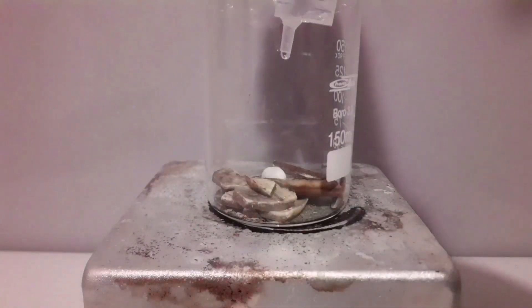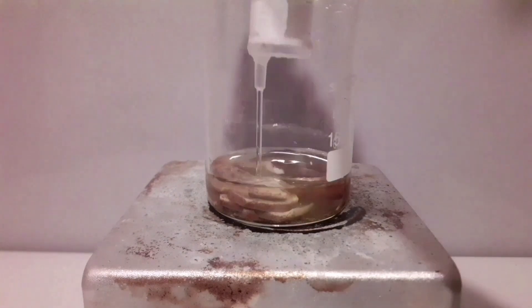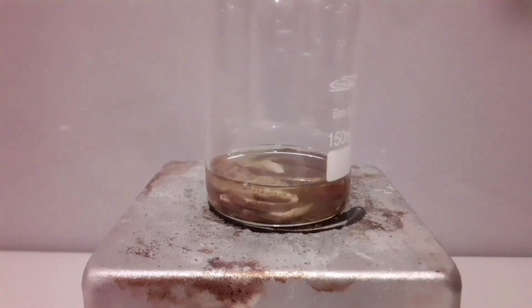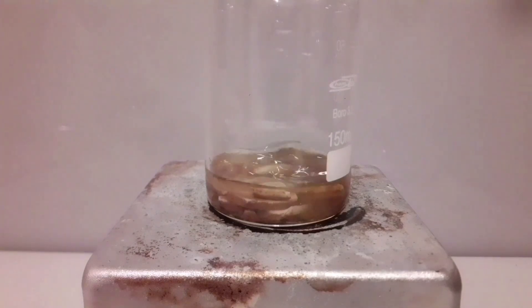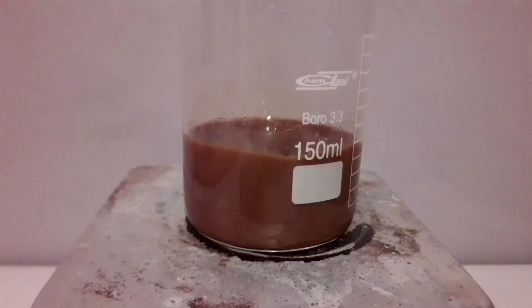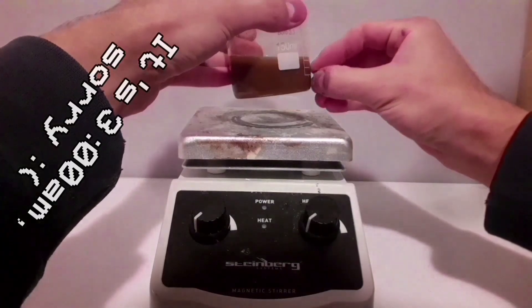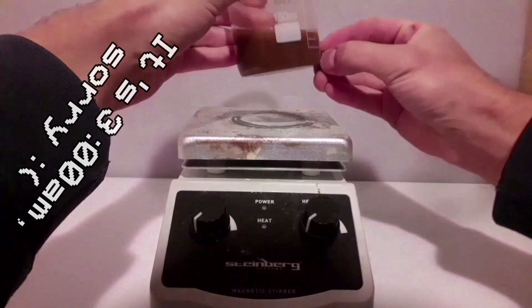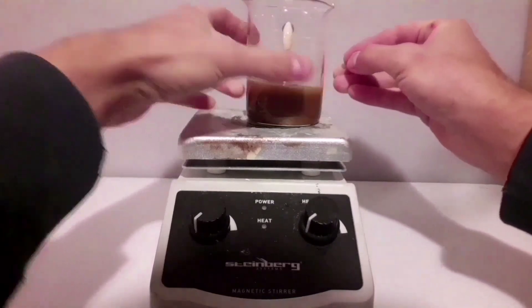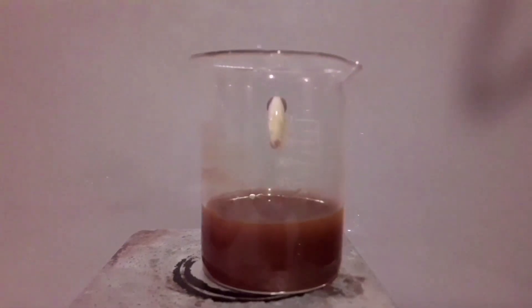After heating to dryness, the product is extracted. It's a mixture of our desired platinum dioxide plus some potassium chloride, potassium hydroxide, some leftover potassium nitrate and other stuff. All this is dissolved in water and then we can filter it.